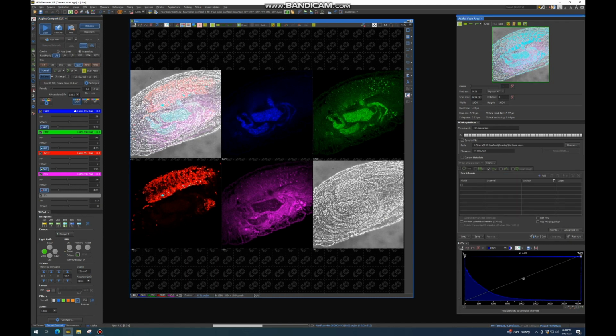So now I will show you the different types of image acquisition that can be done. Here you can take a time lapse of your sample, where you can tell the confocal to image every 10 minutes with specific lasers, and all of that can be adjusted in the advanced setup of this. The next type of image that can be taken is a single XY plane image. To do that, you will just click Add a Point, and then you can add multiple points, and the confocal will go between each of those points and take an image. This gives you a single XY plane.